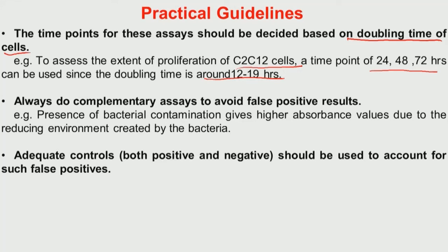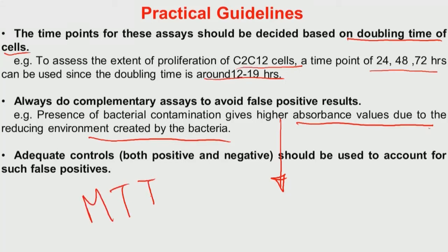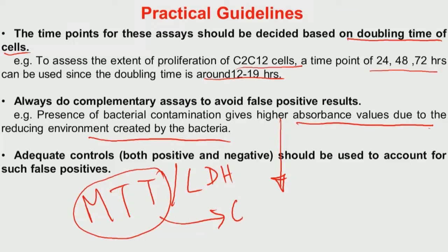And one is to always do complementary assays to avoid any false positive results. For example, presence of bacterial contamination gives higher absorbance values due to the reducing environment created by the bacteria. Now another thing that is quite important to mention: one can use these MTT assays or LDH assays. So particularly the MTT assay is not useful for carbon based materials.